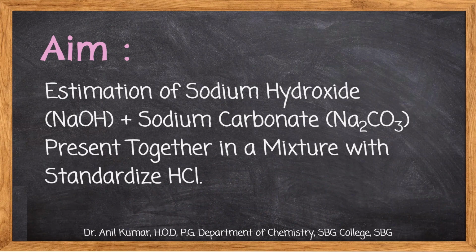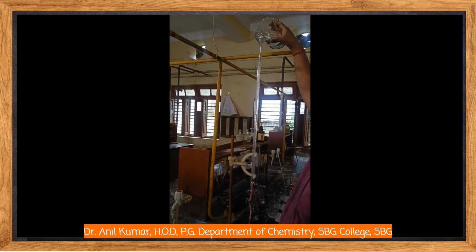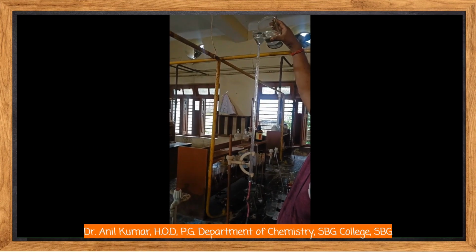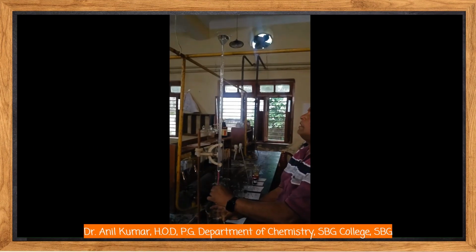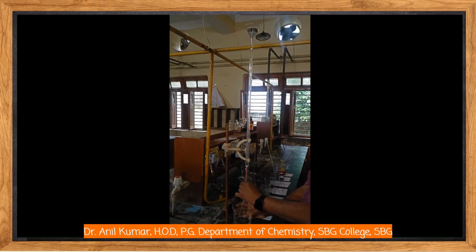And the practical video topic is estimation of sodium hydroxide and sodium carbonate mixture present together in a mixture with standardized HCl. Now, the aim behind the experiment is the estimation of sodium hydroxide, NaOH, plus sodium carbonate, Na2CO3, present together in a mixture with standardized HCl.